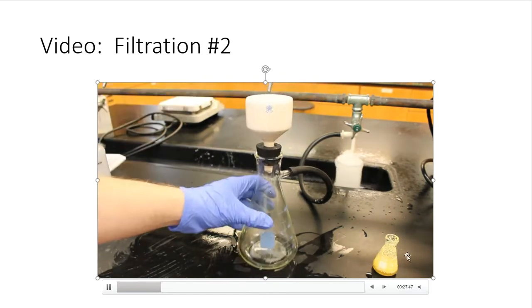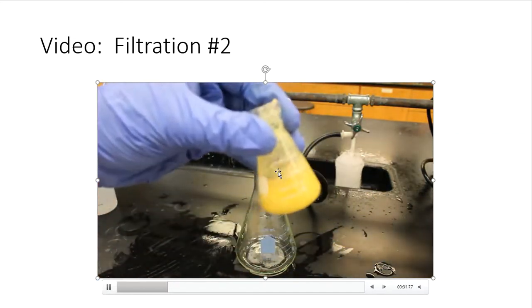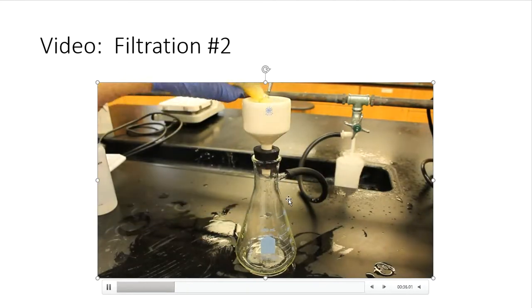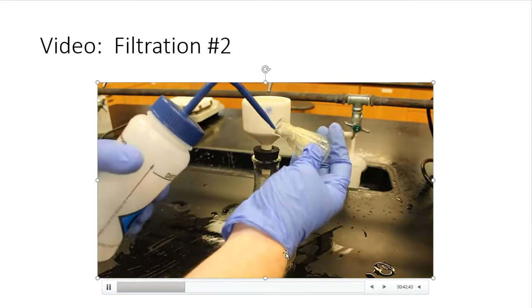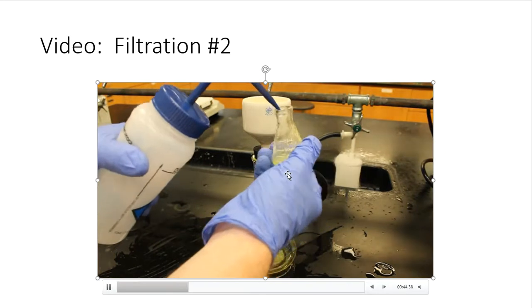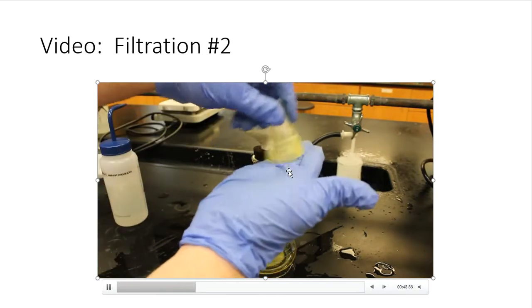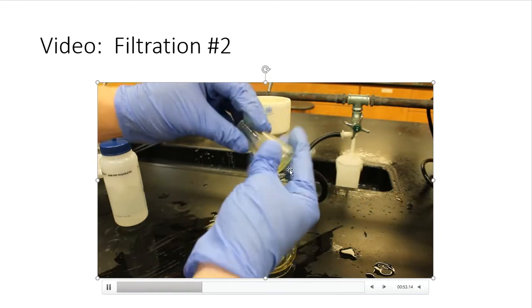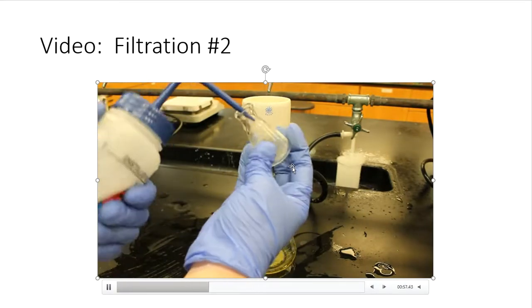And then this is product number 2. So this is from the methyl p-hydroxybenzoate right there. All right, so we're going to dump that through just like we did the first. It's going to be better if you dump it all at once in the very beginning because we have very little crystal. Allow that to pour through and then give your flask a couple of rinses with some DI water. This one rinsed out much better. Now that doesn't mean that it's a better product. It just means that it didn't stick to the sides of the flask like the first one did.